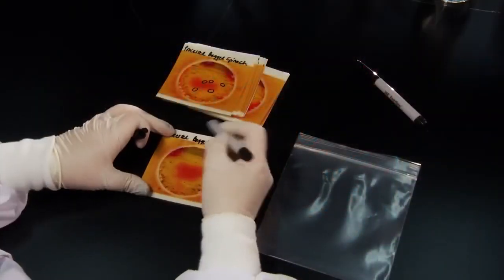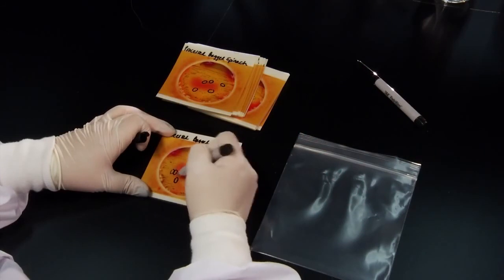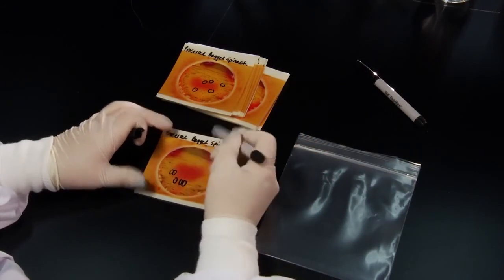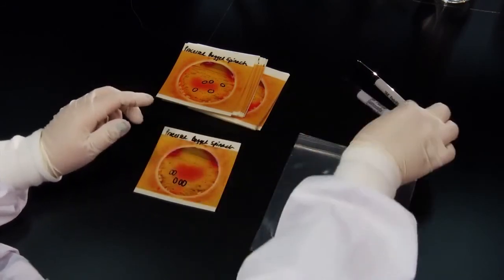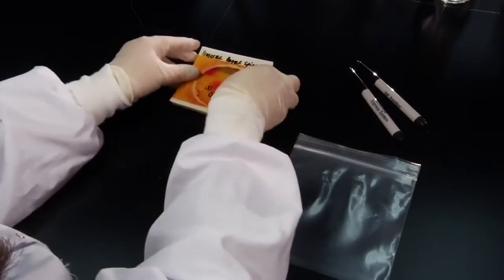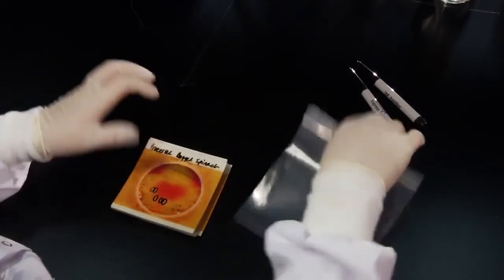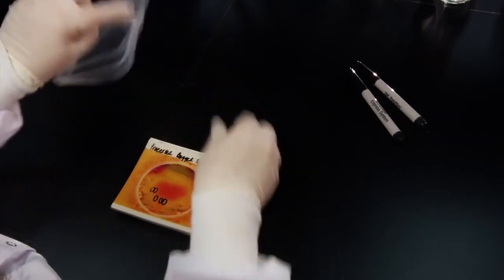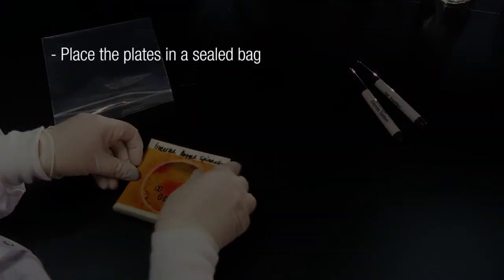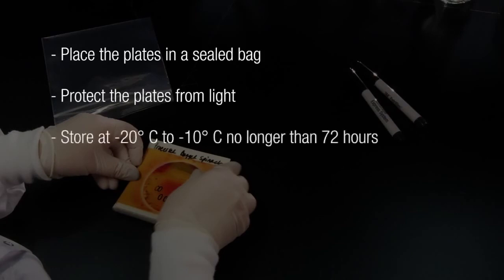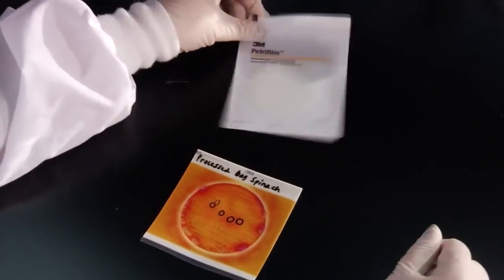Finally, if the 3M Petrifilm Salmonella Express plates cannot be analyzed within one hour of removal from the incubator, circle the presumptive salmonella colonies on the top film with a permanent ultra-fine tip marker. Place the plates in a sealed plastic bag. Make sure to protect the plates from light and store them at negative 20 to negative 10 degrees Celsius for no longer than 72 hours.